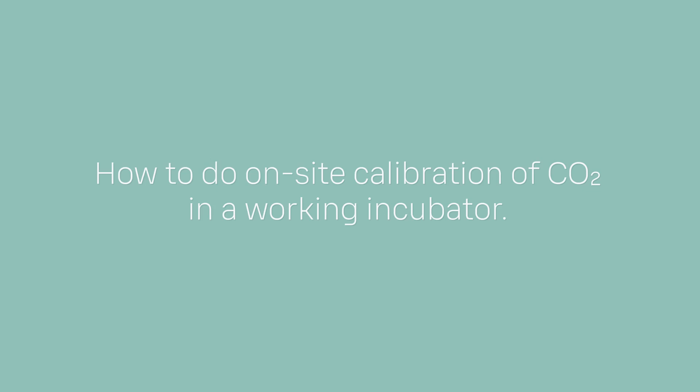Hello, my name is Nevon Mansour and I work as an application engineer at Vaisala. In this video I will demonstrate how to do on-site calibration of CO2 in a working incubator. It's good to remember that even the best high performance measurement instruments require regular calibration and maintenance to ensure that they are working and providing the most accurate data possible.